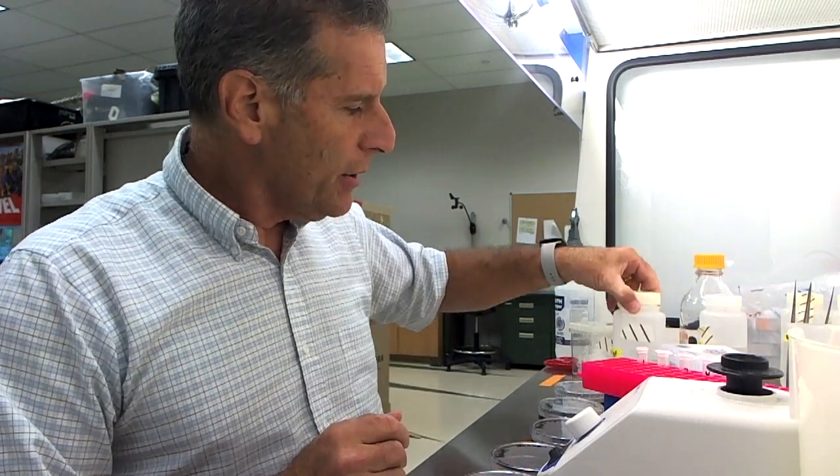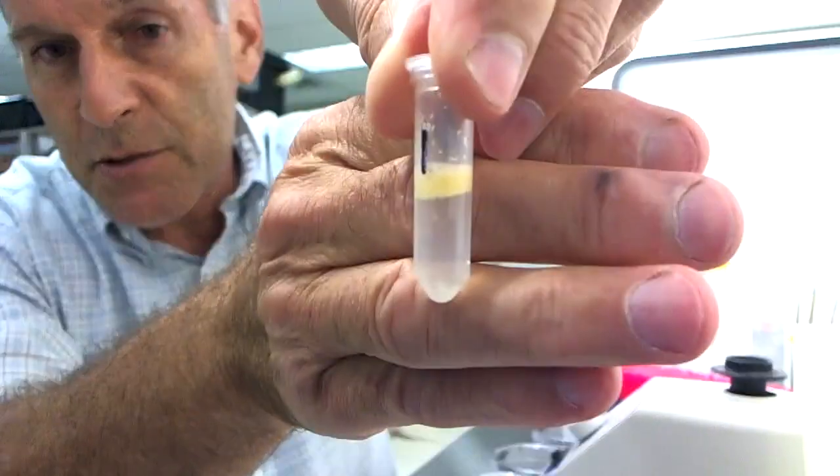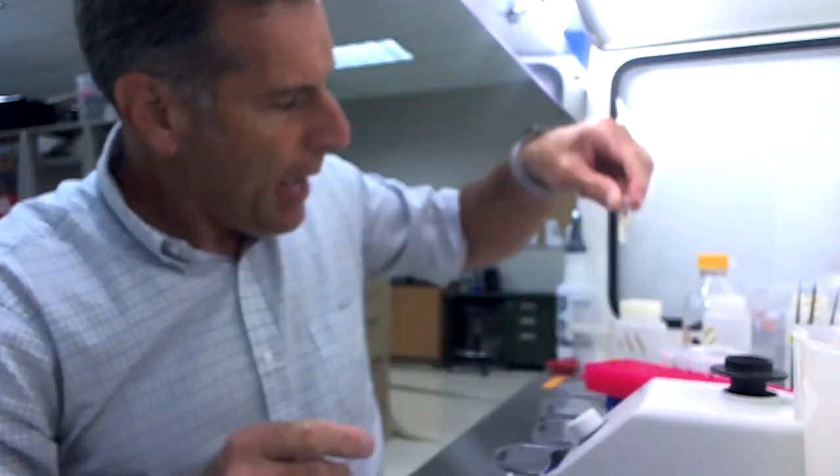Now it's time to pipe off the bleach. Previously we poured off the bleach, but we can't do that now — we'll pipe it off. I'll show you how to do that. We'll add water as a rinse and do this four to five times, then plate the seeds. These are floaters, so what we have to do is take the pipette tip underneath that floating raft of orchid seeds and pull out the old water and bleach.